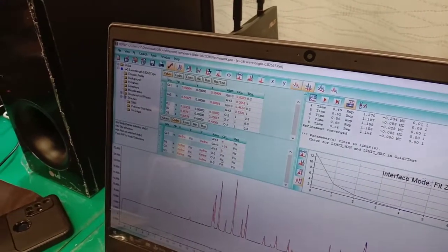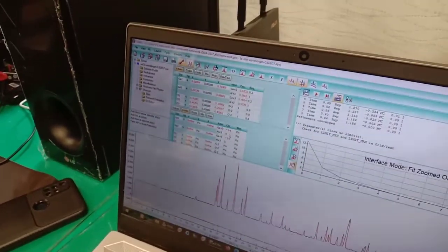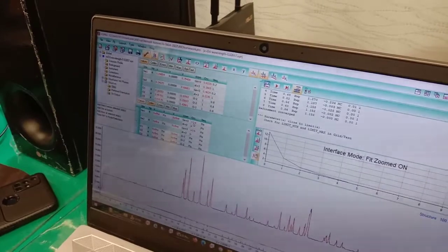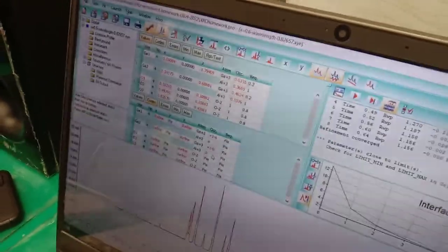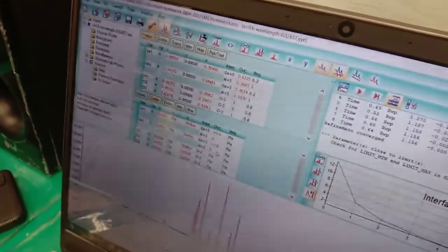But again, in this case of numbers, A is 1 minus A or 1 minus B, it's not always true. Sometimes you have to use some kind of special equation like 2A.